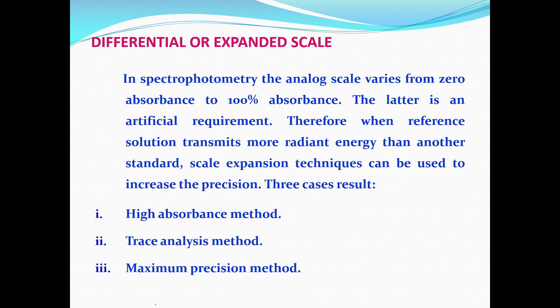Okay. So, now we go to another aspect of how to determine the substances at very high or very low concentrations. This also I had explained to you yesterday. I am going to do it in a slightly more detail now, because quite often we come across situations where we do not want to dilute a sample to within 0.2 to 0.8 absorbance.